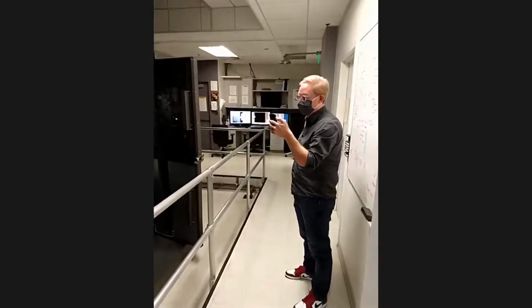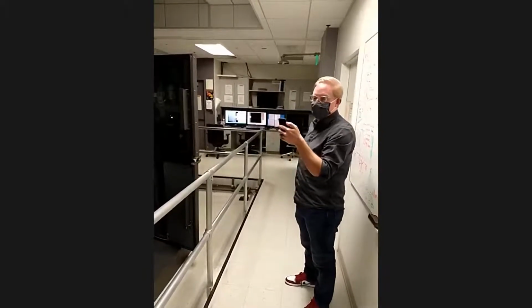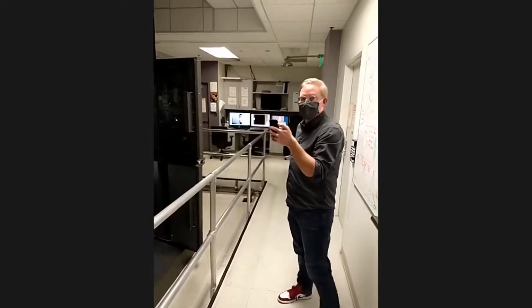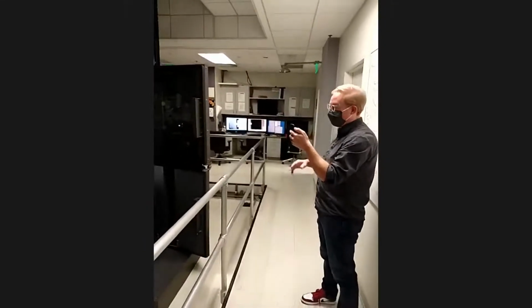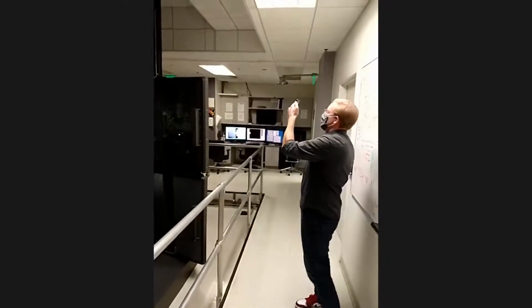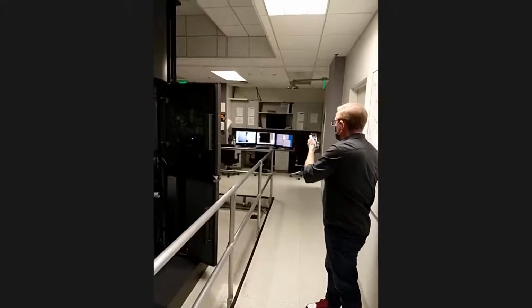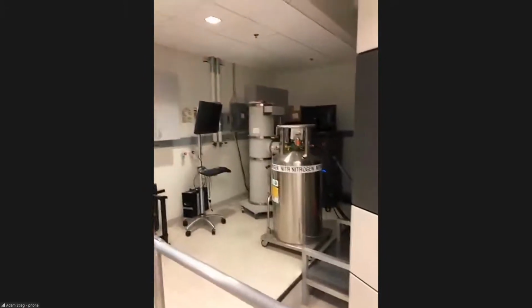So this microscope is basically, as Peng said, the Porsche or the Ferrari of this type of technology. You can see that it's built into its own room, right? As we've been looking around, you can see it's quite large, right? It's built into a customized room in the basement, so that it can produce a very, very quiet environment to do these types of measurements.